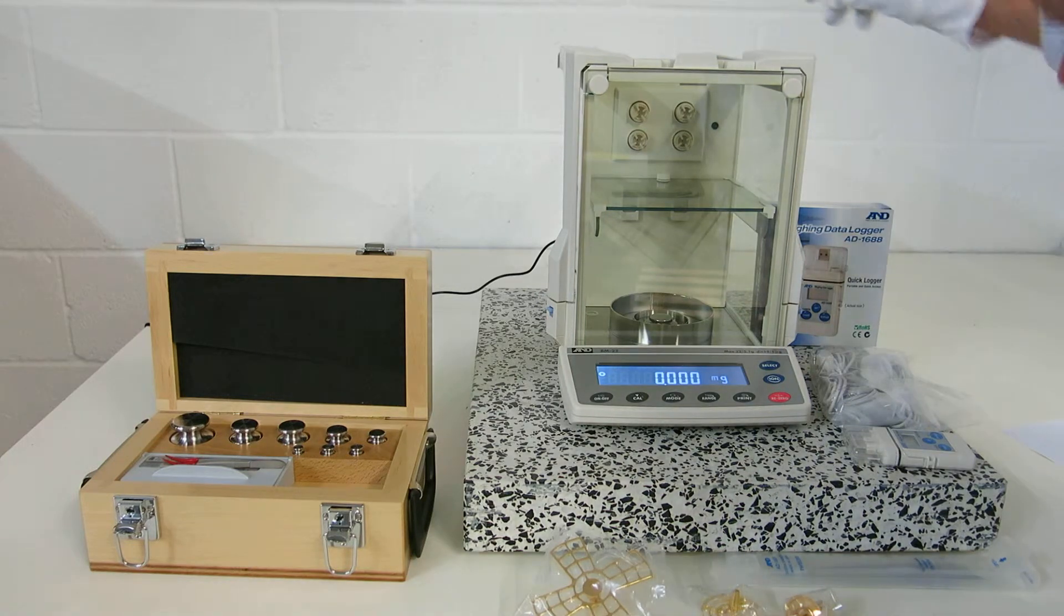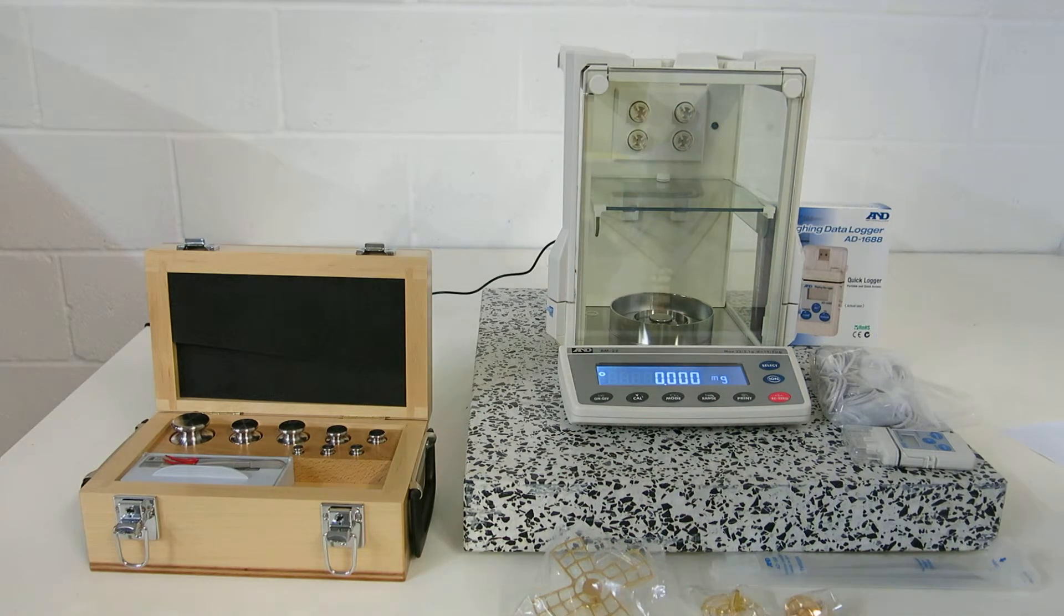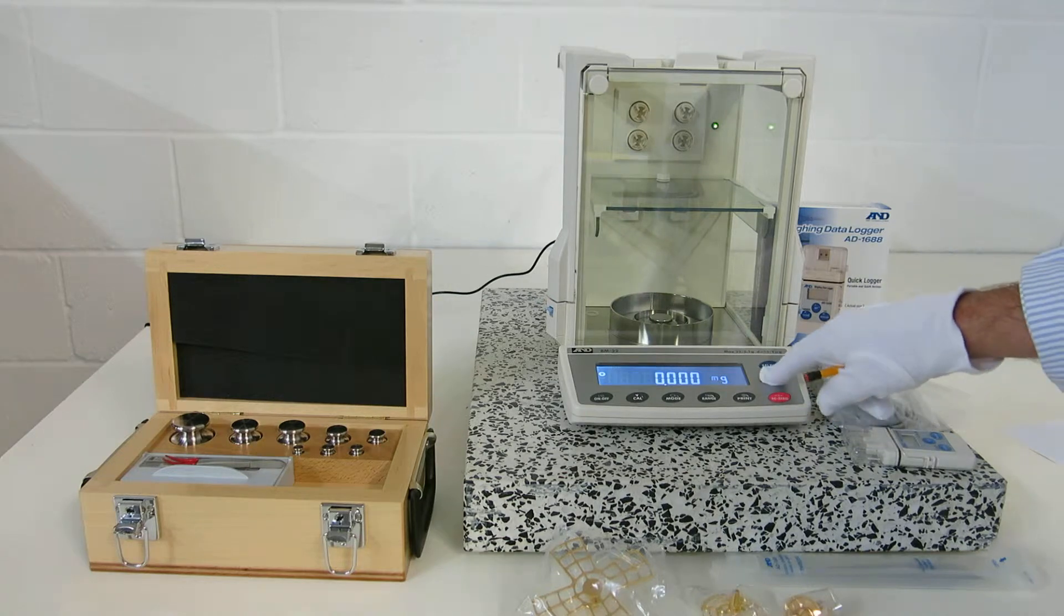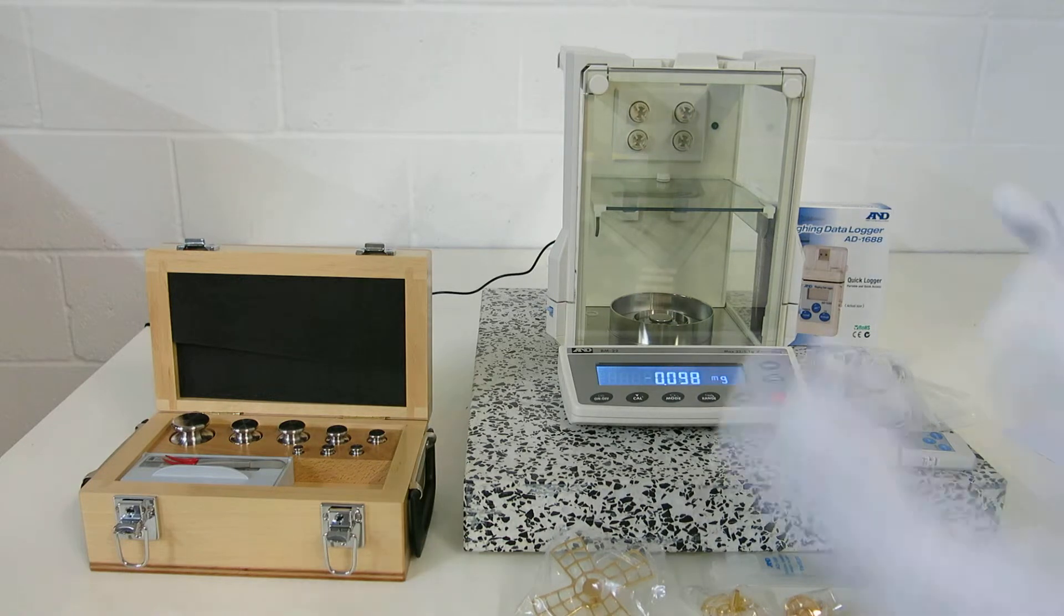It's also got a built-in fanless ionizer, which are here. One of the biggest problems are errors due to static electricity, and the beauty with this is if you press the ION button here, which is the green button you can see, you run the sample in front of it, that neutralizes it, and you don't get any of the errors traditionally associated with static electricity.